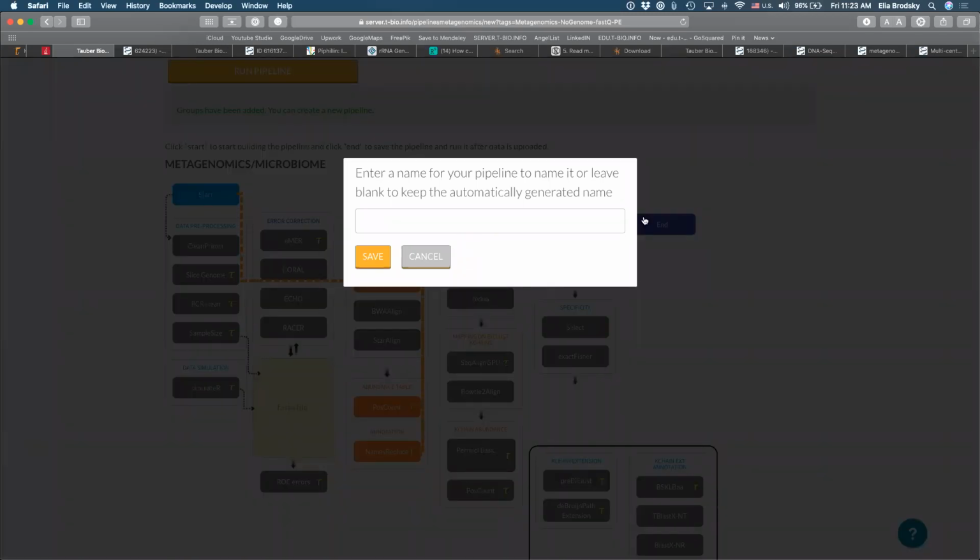What I am showing you here is an example. Does anyone have any questions about how to analyze data from NCBI? Important to remember that when you save, it has to be in .txt. So when you download the file, it's in txt. Somehow they save it in txt, but they actually add commas in there. So I don't know what happened on NCBI's end. So that's why we edit it, just to open it in Excel. But if you want to do the same, basically it has to be in txt.